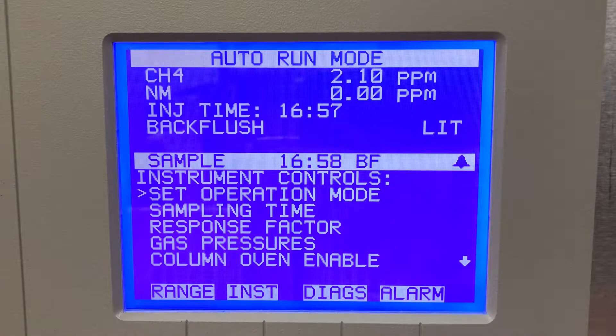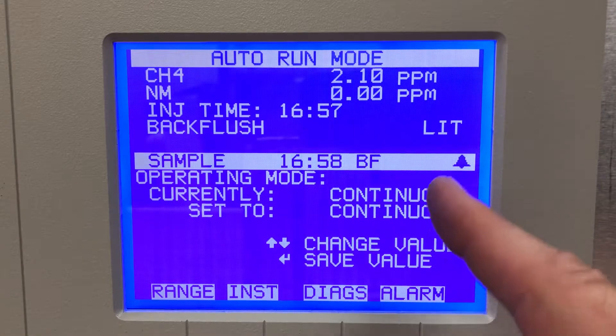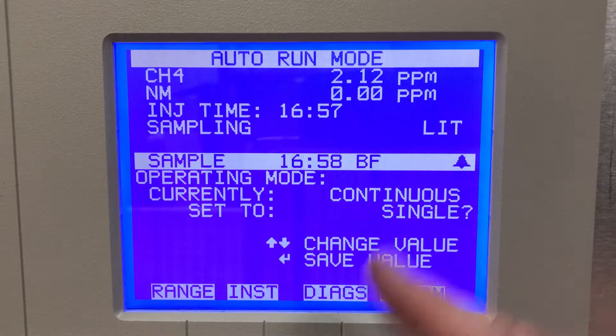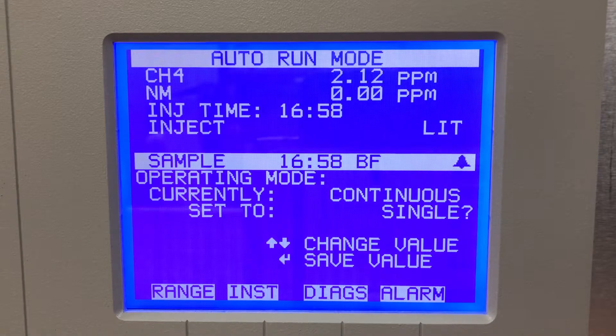Under instrument controls you can set an operation mode. Right now we are in continuous, which means it just runs a continuous sample loop all the time. I can set it to single and it would stop after that single run.